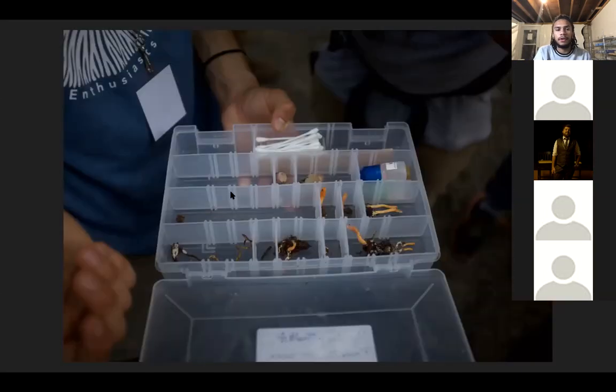So typically what I do from wild is I'll clone it, which is way more tedious and takes more time, and not everybody needs to do this. My friend Ryan Gates from Terrestrial Fungi, he just takes spores from the wild specimen. This is a great way to go about it because it reduces a lot of time. But the reason that I take clones is because I personally feel, and this isn't scientifically proven, that if I take a clone and it's capable of fruiting in vitro, like in culture, then the offspring are probably going to have better success rates with being cultivated inside.